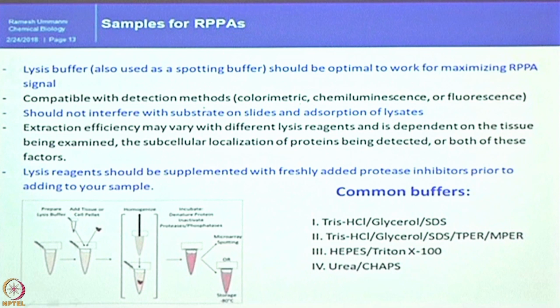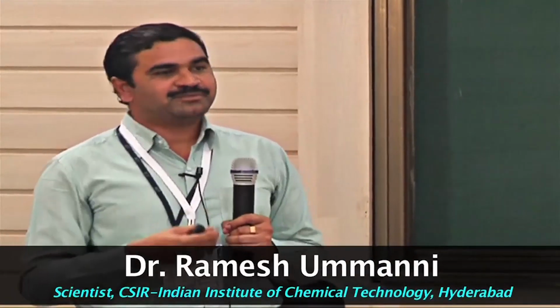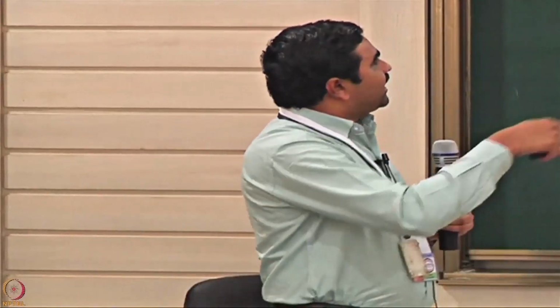Extraction efficiency may vary with the different lysis reagents and is dependent on the tissue being examined. For example, if you are taking a prostate tissue, which will have some stones, then you need a stringent buffer. If you are lysing cell lines, a simple RIPA buffer is sufficient, or MPER buffer is sufficient. The lysis reagent should be supplemented with freshly added protease inhibitors. Of course, if you want to understand post translational modifications, you need inhibitor cocktails like phosphatase inhibitors and also protease inhibitors so as not to degrade the protein of interest.